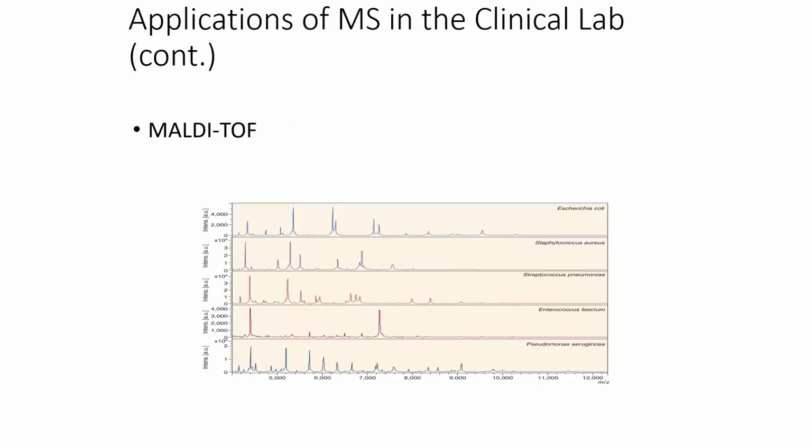So this is a picture of the spectra for the MALDI of different species. If we have an unknown species, we can compare it to the library of known spectra.